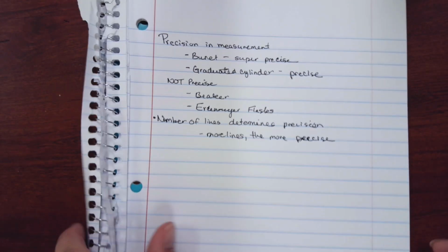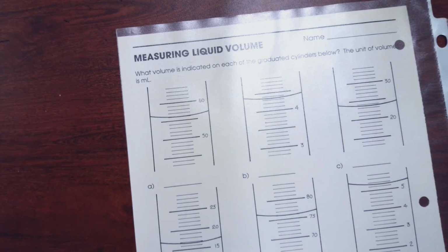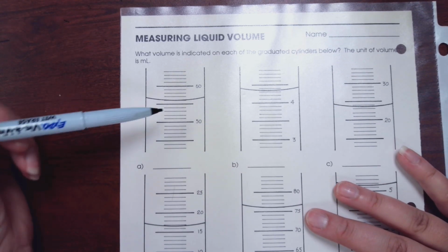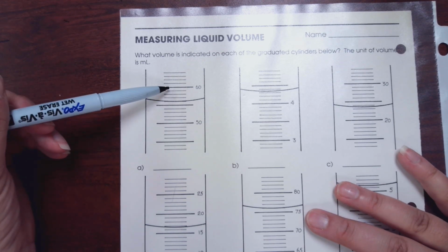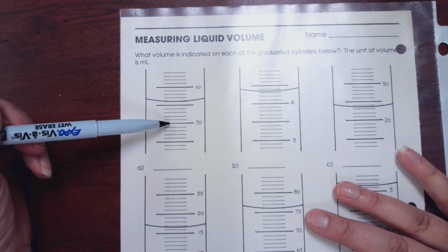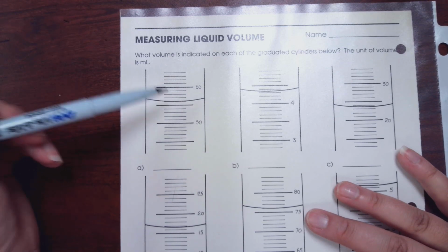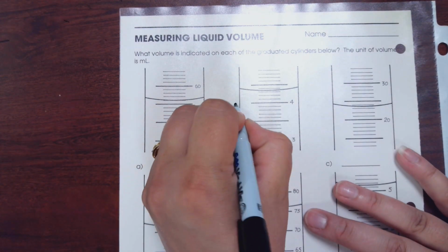So when we're reading one of our tools, and I'm going to use some pictures of them just because it's a little easier, we want to make sure that we are reading to the level of precision that the tool provides. So if you look at this here, we've got a graduated cylinder section. We have the 50, we have the 60, but then we have our lines in between, so that's our ones place. All right, so we can see that the liquid line is right on the 56 line. So most people would write this volume as 56 milliliters.